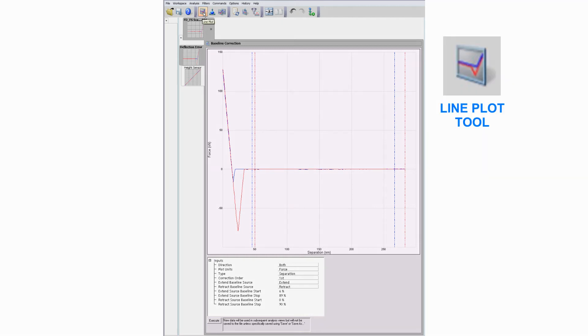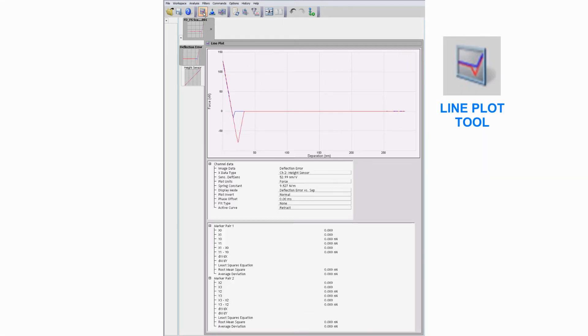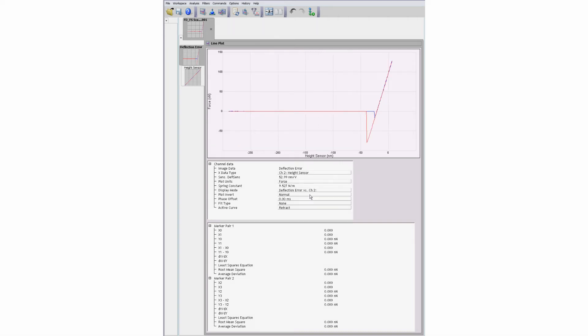Use the line plot display to measure the sensitivity of the deflection axis. Move the cursors to mark the boundaries of the linear portion of the ramp and select the fit model.